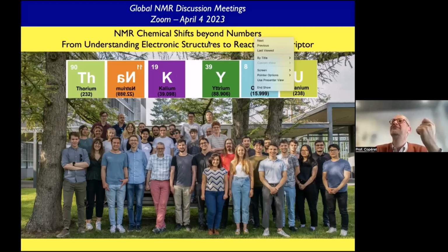And then it gets very difficult to actually, I mean, you can rationalize it, you can decompose it, but it's much more difficult to explain trends. So it's much more difficult. But otherwise, what I showed you today applies to any nuclei in any system. The caveat is when it goes to basically conductive material, where today there is no methodology to understand it, even though some people are working on it.